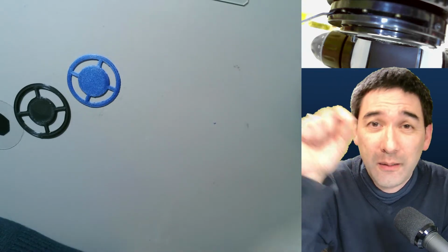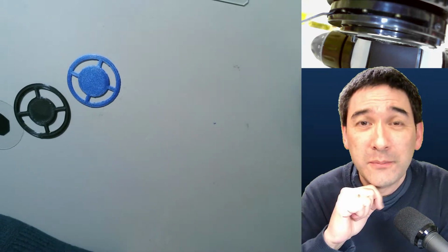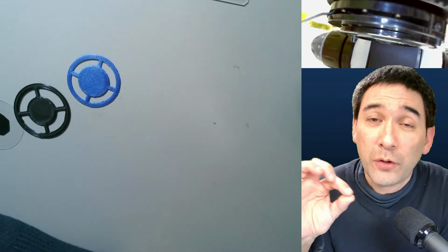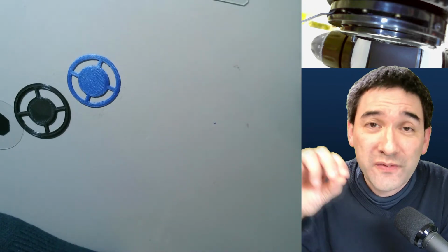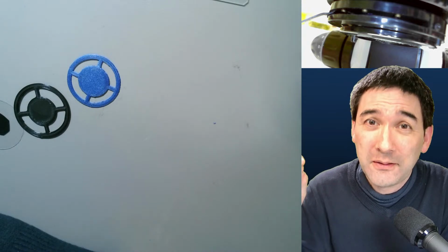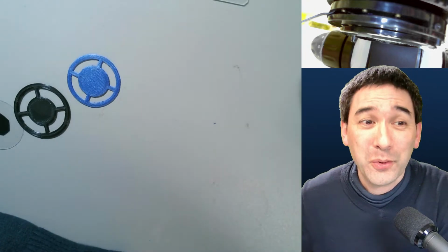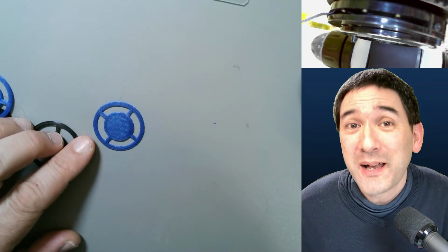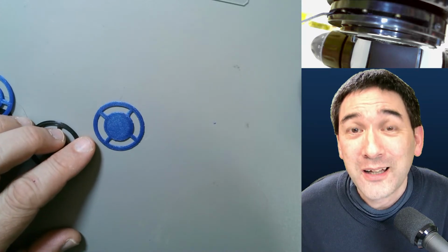Yeah. So particles that are moving randomly, and very often if you look into a cell at vesicles moving, there is a directional movement because those vesicles are being pulled around. But the reason you wouldn't like my answer is that it doesn't matter which one of those, it's not considered alive.